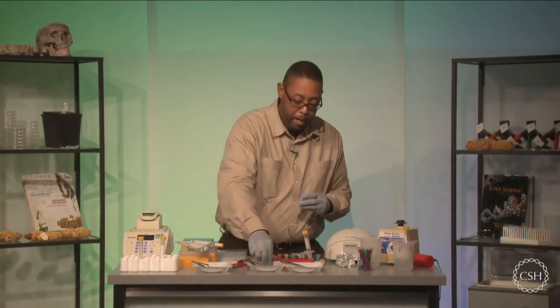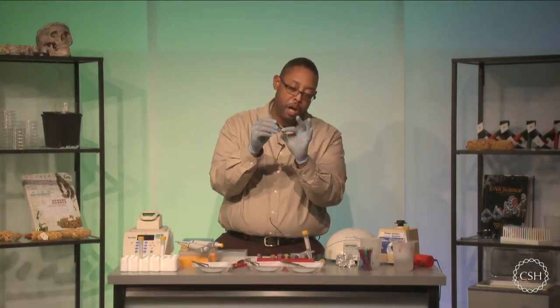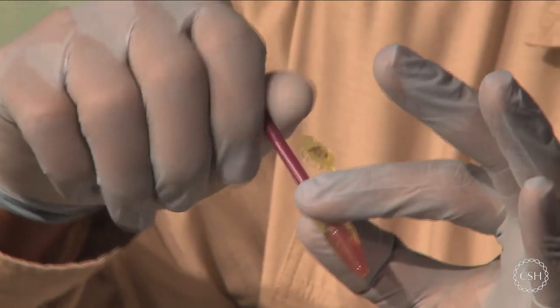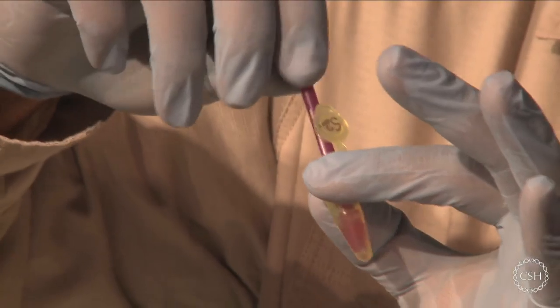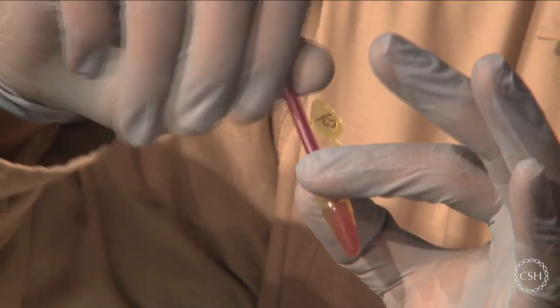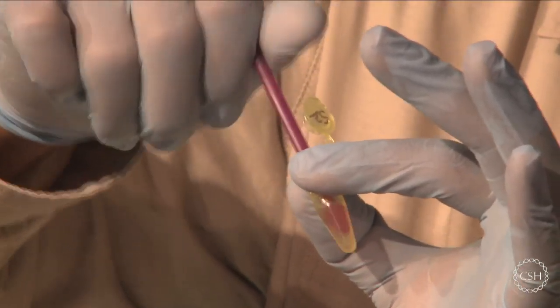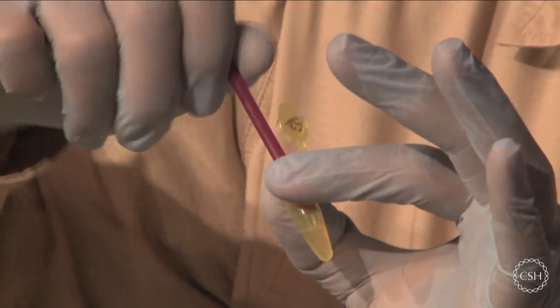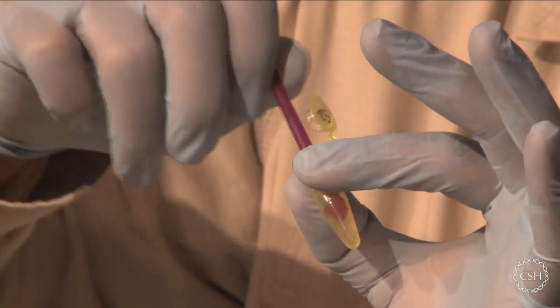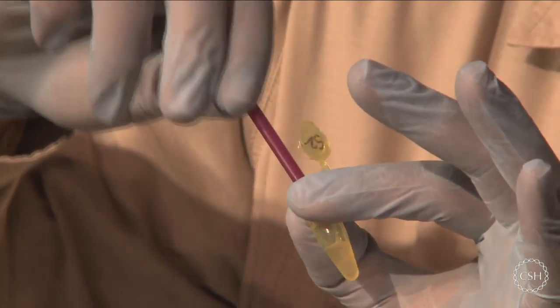Sample number two is my meat. And again, you're going to want to make sure the tissue is back down at the bottom of the test tube. But you're going to notice that most meats do grind up very easily inside of this lysis solution. So please make sure that you get thorough grinding, but that most of the tissue is nice and evenly mixed into the solution. So once I've ground up the tissue, and I can see that it's broken up pretty well, I can then stop and then move on to the next sample.